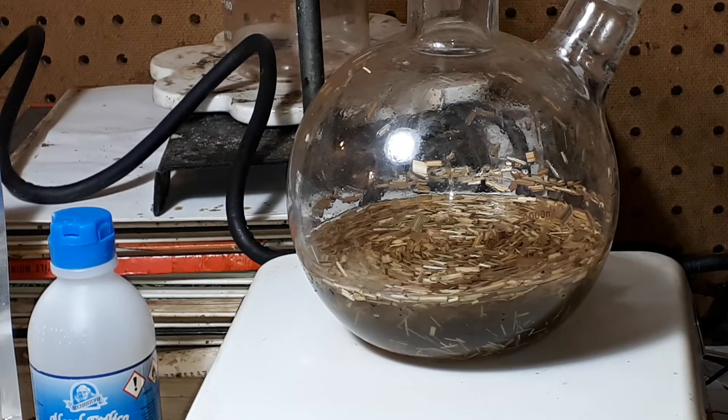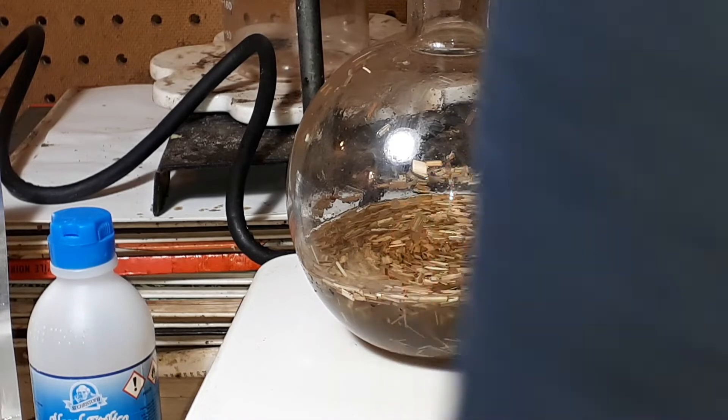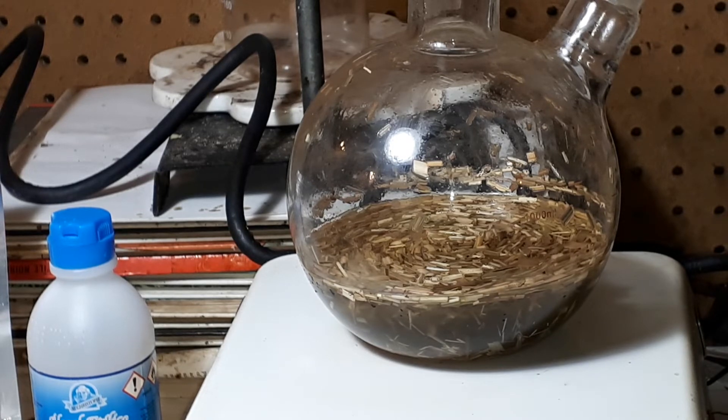Let's measure the temperature with the thermometer — 58 degrees Celsius. The alcohol will boil at 78-80 degrees Celsius. But I'm going to turn it off for now and just let it sit and soak.